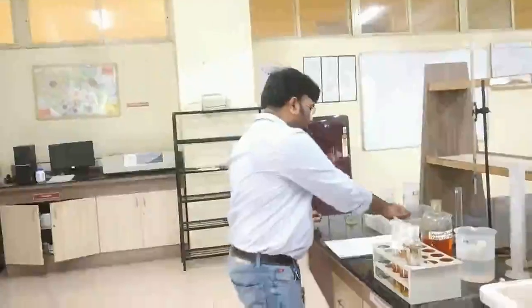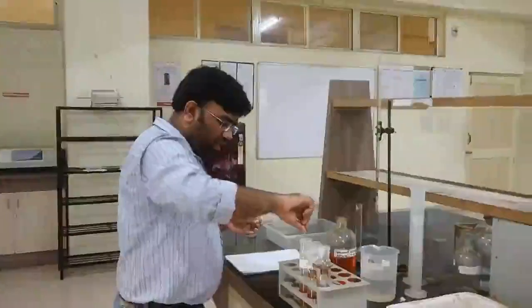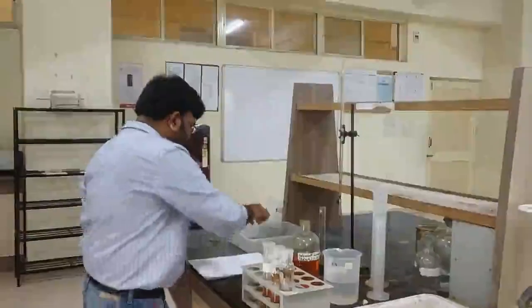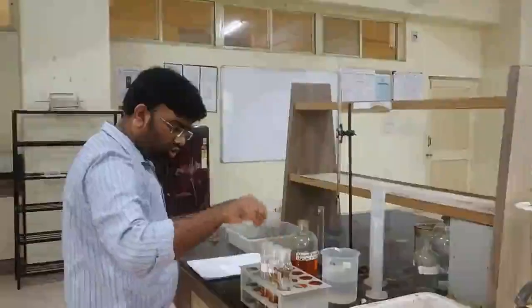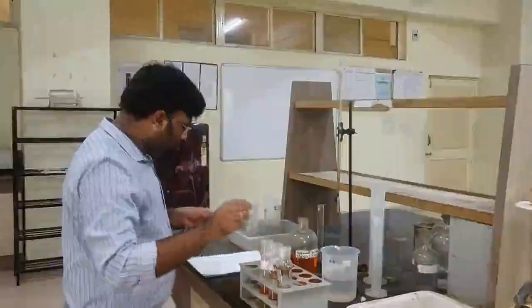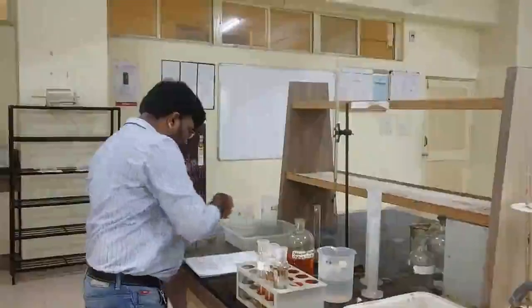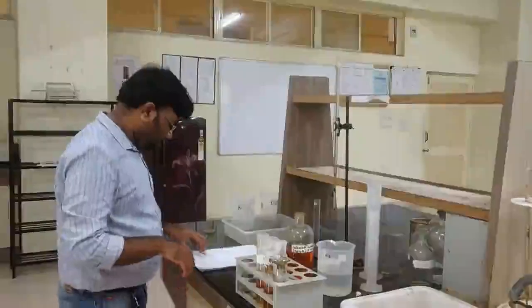So I'll be adding glass beads into it. They are just glass particles that we need to add, two into each of these, so that the bumping action will get avoided.